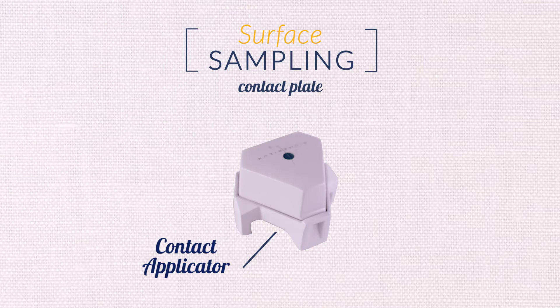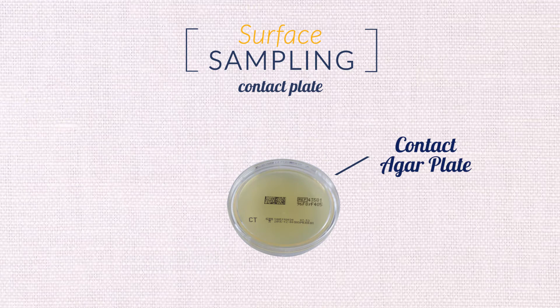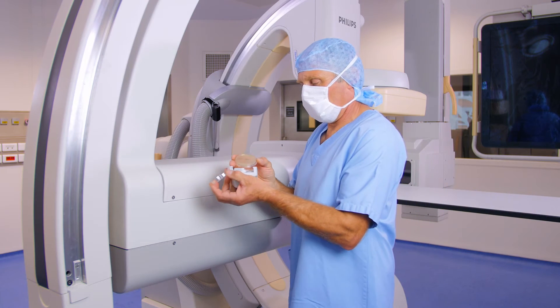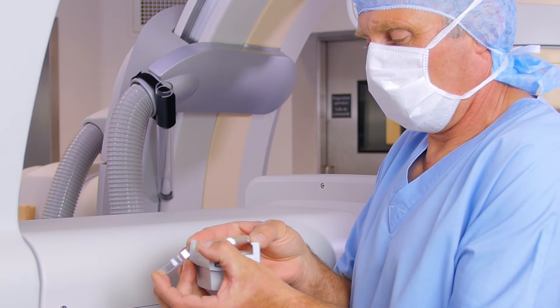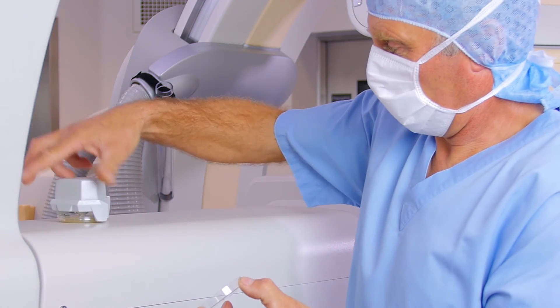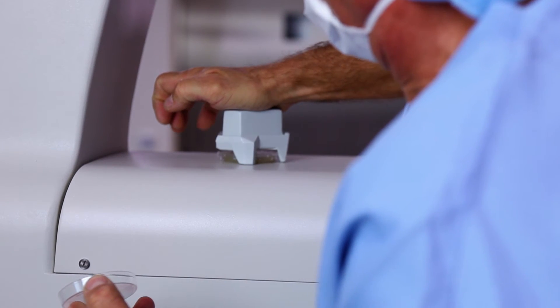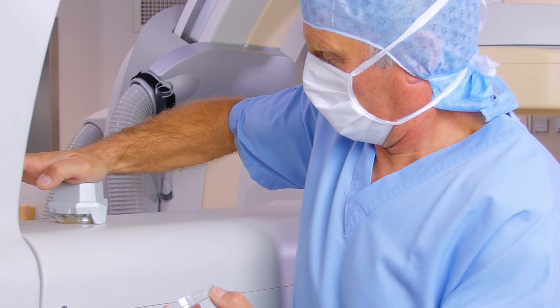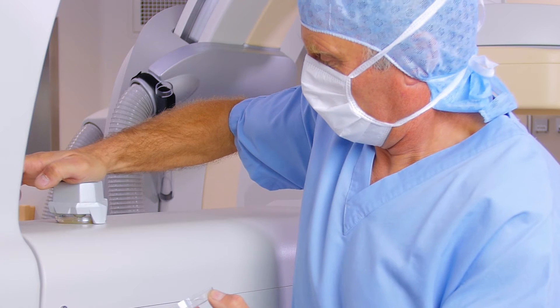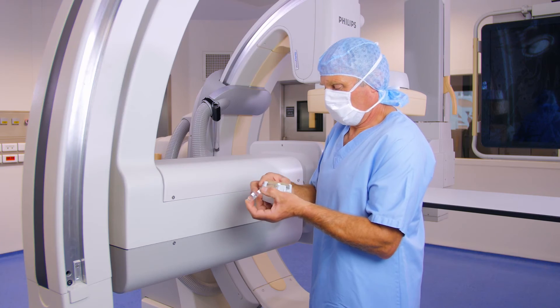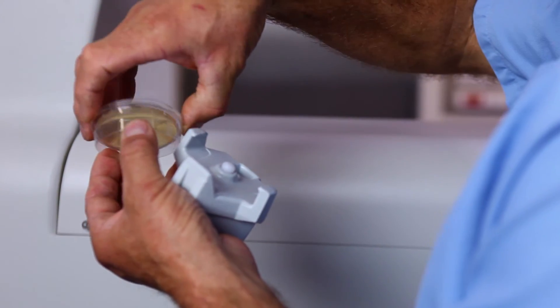The sampling is carried out on a 25cm square area, this being the contact plate surface area. Place the agar on the applicator and place it on the sampling area. Hold down for 10 seconds without moving. As soon as the sampling is over, close the agar contact plate case upside down with the lid down. Hold this position so as to avoid any condensation from the incubation period falling on the agar.